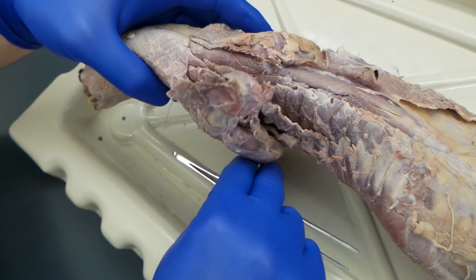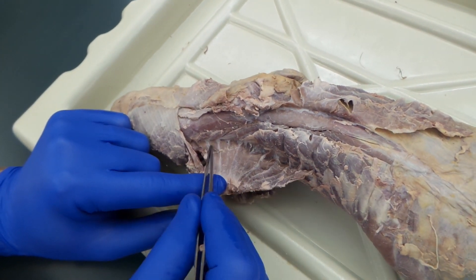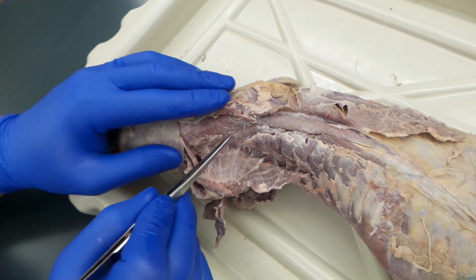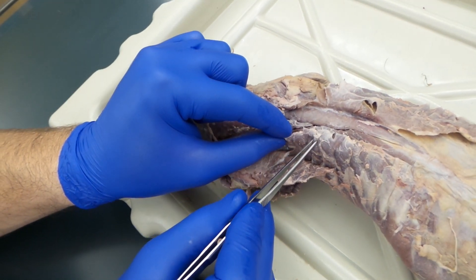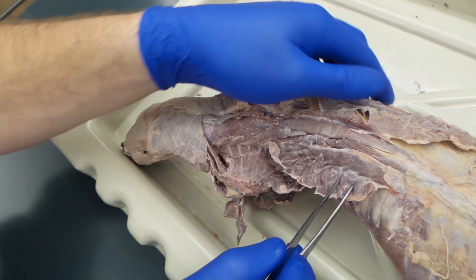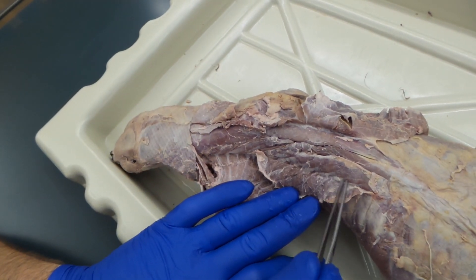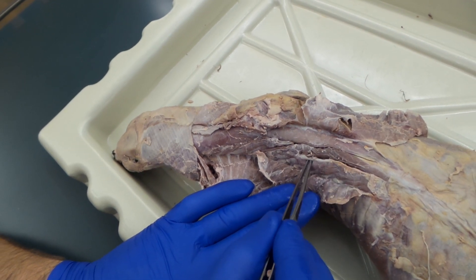Now for the deep muscles — kind of tuck the elbow down. You're looking at your serratus ventralis, which you should be able to identify from this angle as well as from the anterior. There's going to be some fascia; cut along that and you're going to separate out the serratus dorsalis. Underneath your serratus dorsalis, you see this bacon-y looking muscle with white lines — that's your iliocostalis.